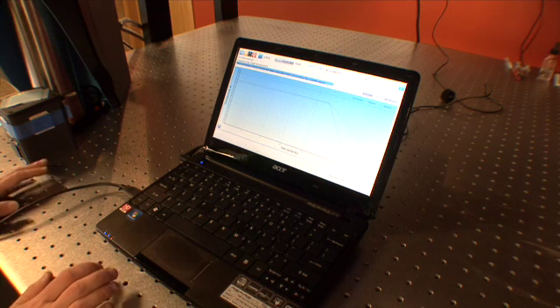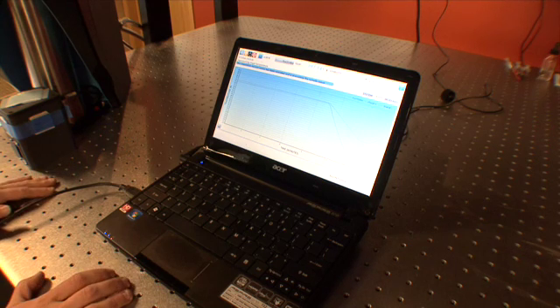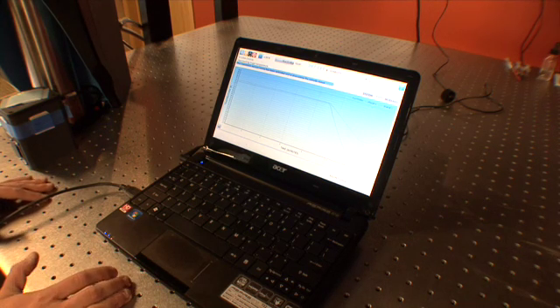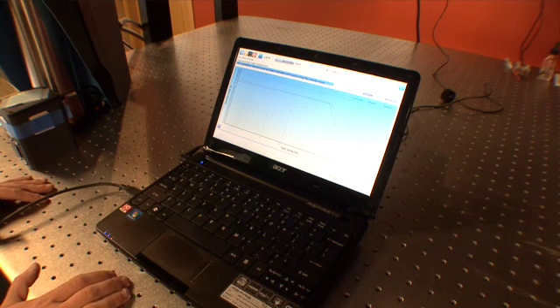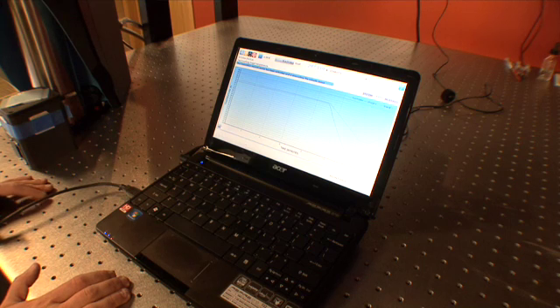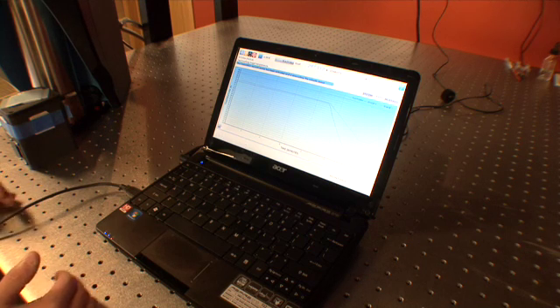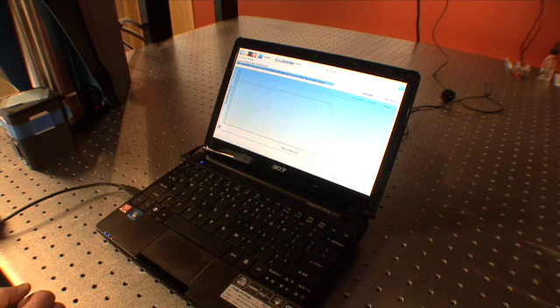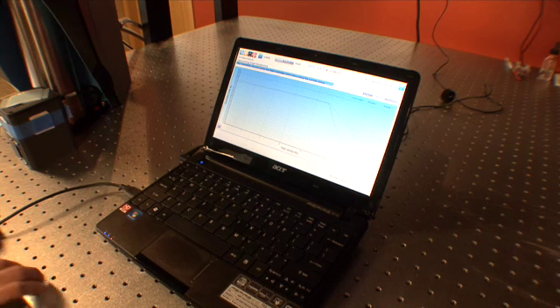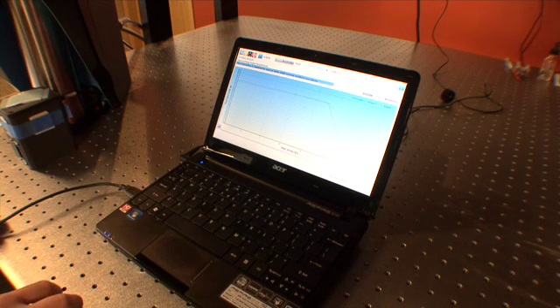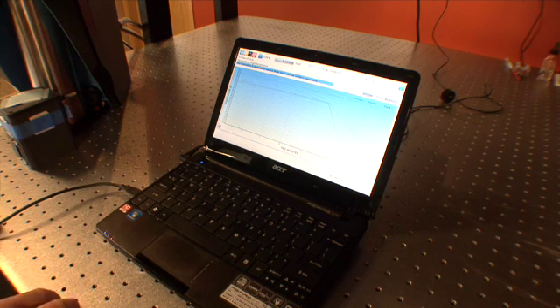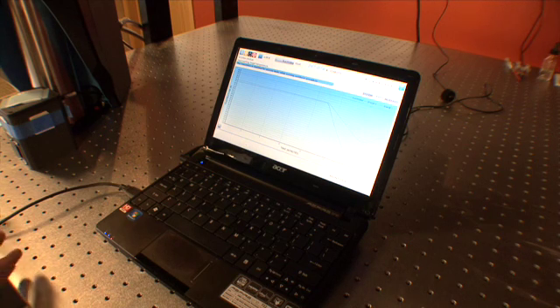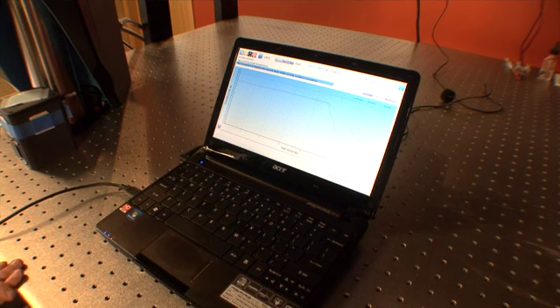You'll hear the roughing pump start and the case valve open, and the system will begin to pump down in pressure. Both the case valve and the pump are located in the control unit, so you'll hear all this happening within the control unit.